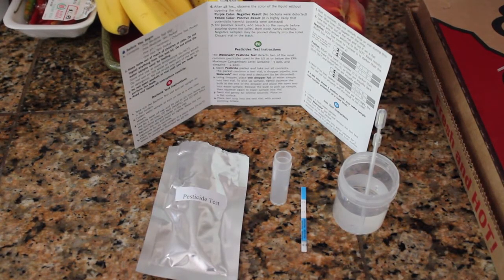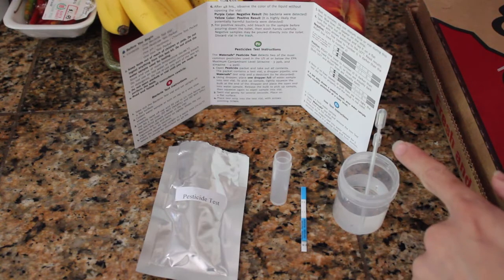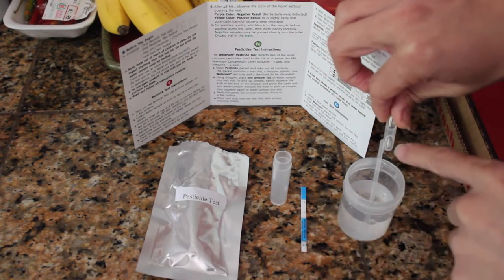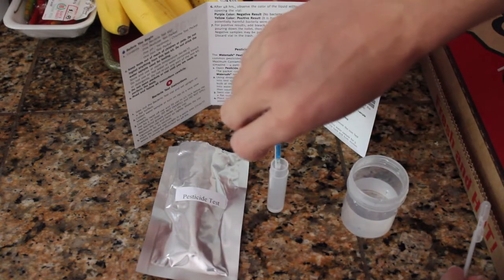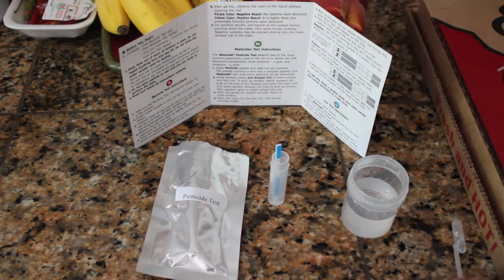The next test is the pesticide test. This is going to test our tap water for the two most common pesticides one would expect to find in their water: atrazine and simazine. It tests for levels above 3ppb and 4ppb respectively. We have a vial which we're going to fill with water using the little pipette that comes with the test, then we put this little test strip in there, let it sit for about 10 minutes, and it'll let us know if we have toxic levels of either of those pesticides. We just give it one full squeeze to fill the pre-measured amount in the pipette, squeeze it back out into the vial, then put in the strip and wait about 10 minutes.